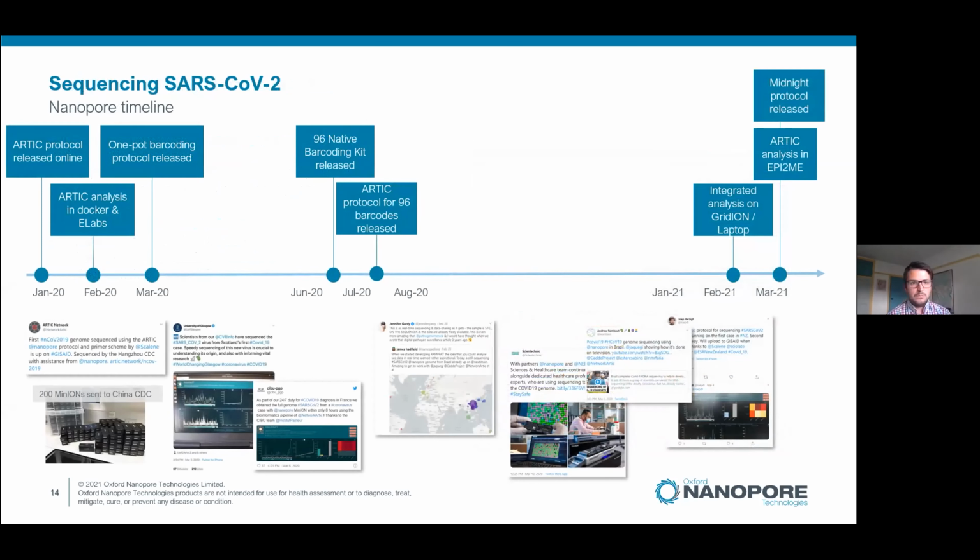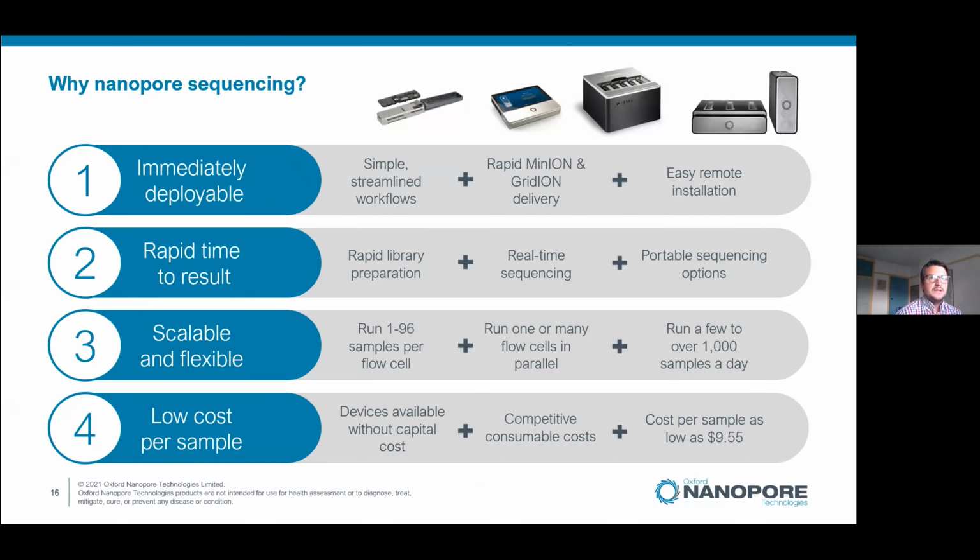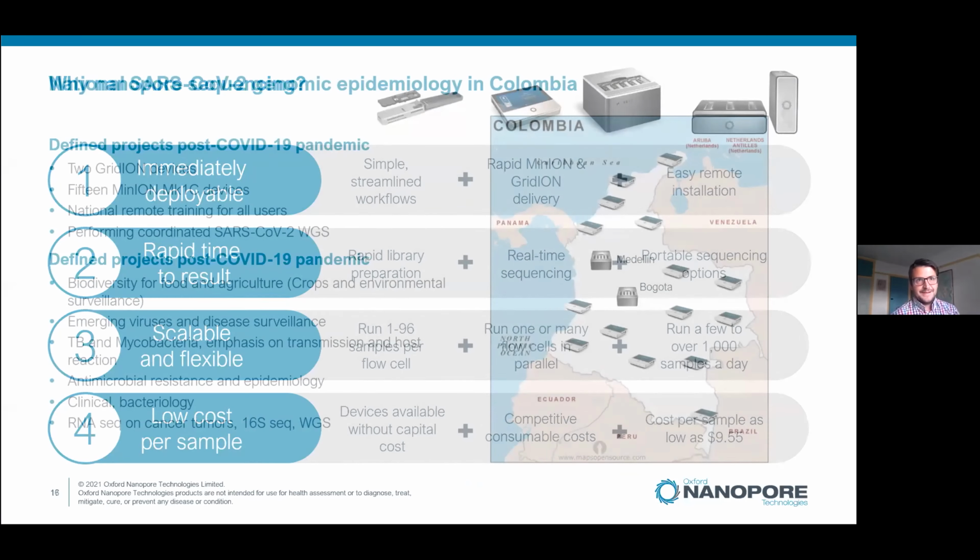So we can quickly go over the timeline and how we worked in collaboration with them, and how the rapid deployability of Nanopore, the rapid change of Oxford Nanopore in general, was able to work throughout the pandemic to really start to deliver some of the genomes that we sequenced on for SARS-CoV-2. Let's skip this slide, and this slide.